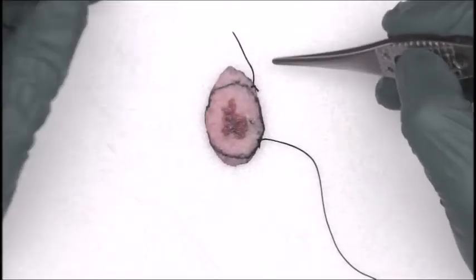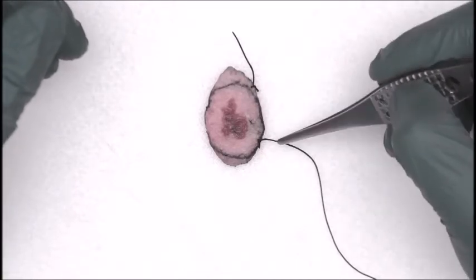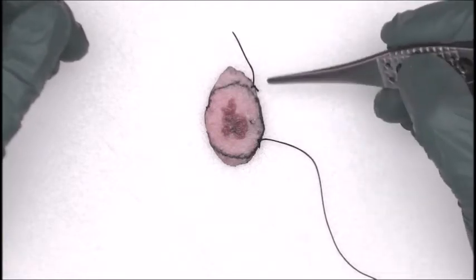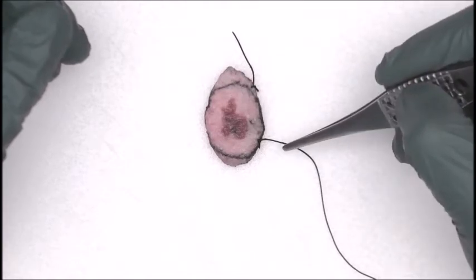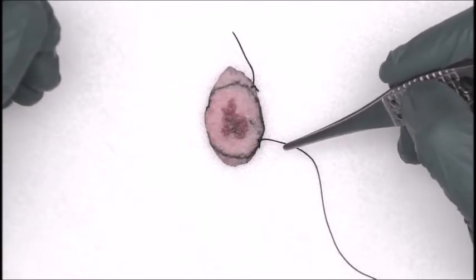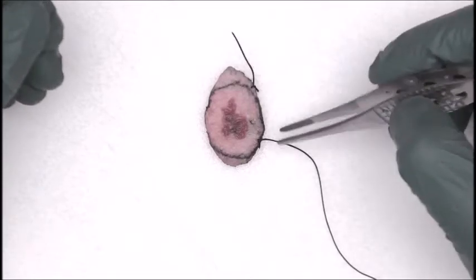Now, as far as orienting the specimen, these sutures came already oriented. They said that the short suture is superior, the long suture is lateral. Sometimes these specimens will come with the sutures attached but no designation or orientation to them. You may have to call the physician or the dermatologist. So in this case, it's short suture superior and long lateral.